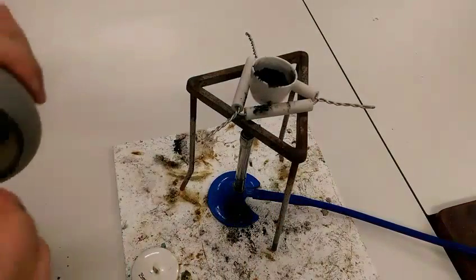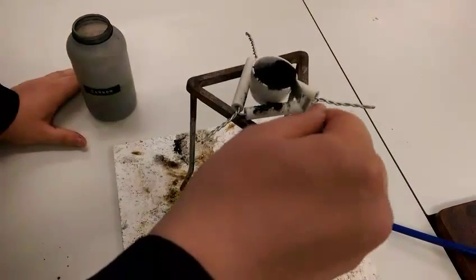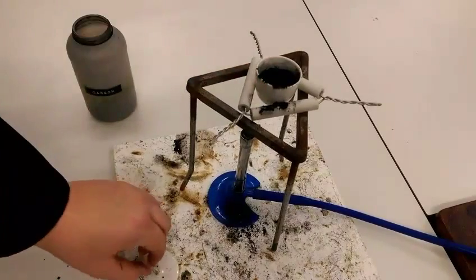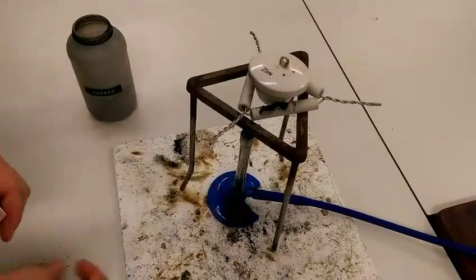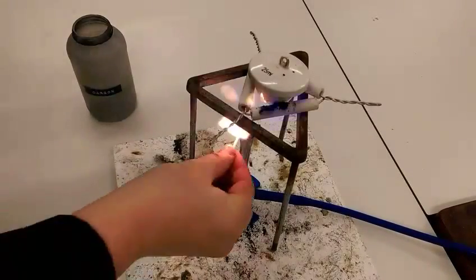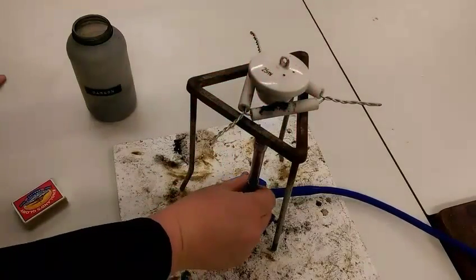On top, I'm just going to add one more layer of carbon over the top of my powder to help it along. Then I'm going to put my lid back on. I'm going to light my Bunsen burner. We want it strongly heated, so we're going to put it on the blue flame for a while.